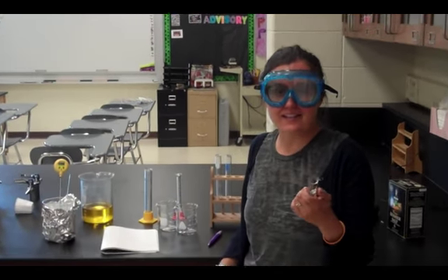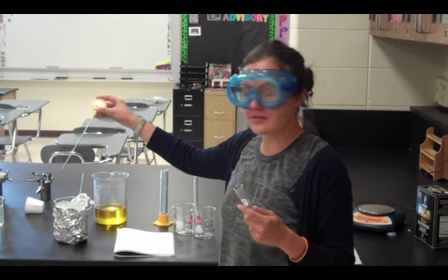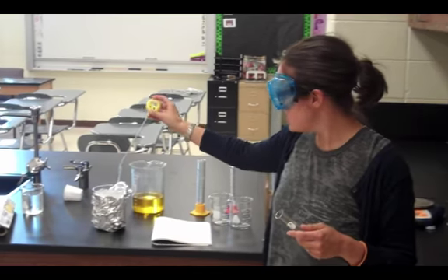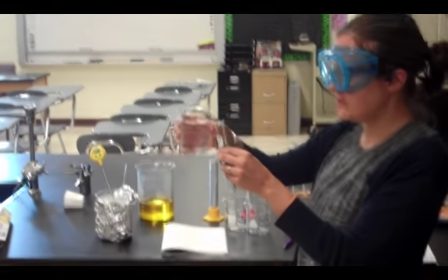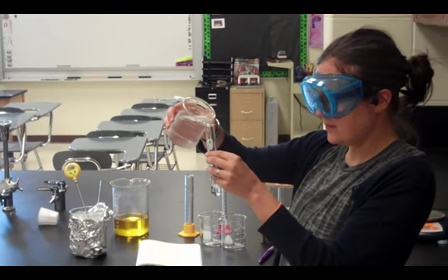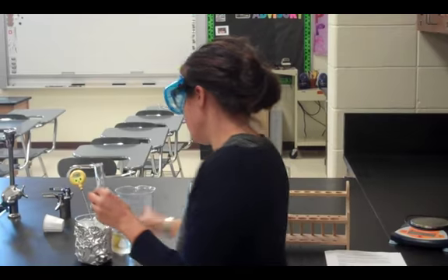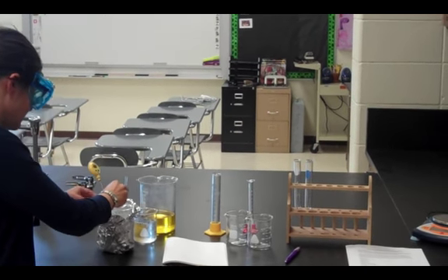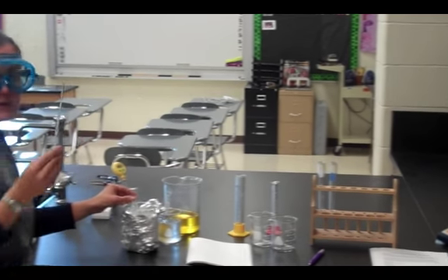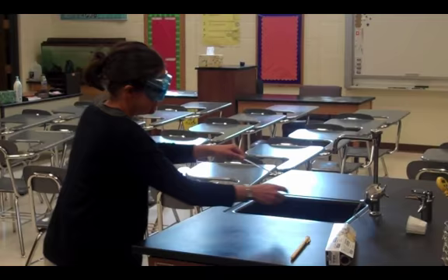Alright, now we're going to find the freezing point of water, but according to the thermometer that you are going to be using during this lab. So you need to take one of your small test tubes, fill it halfway with water, place it in your ice bath. You need to rinse your stirring rod because it has salt on it.